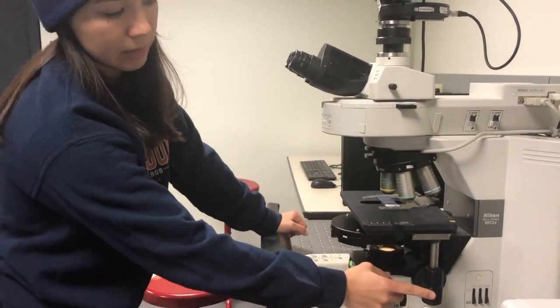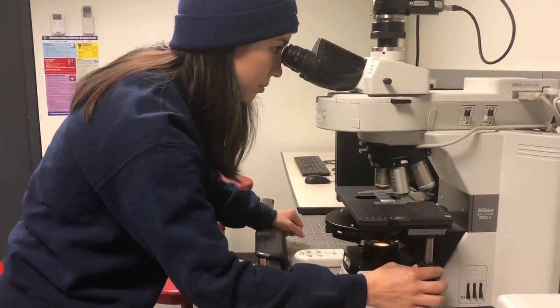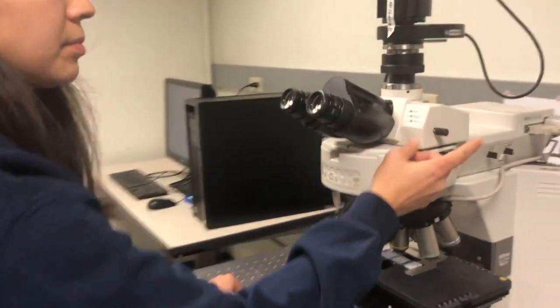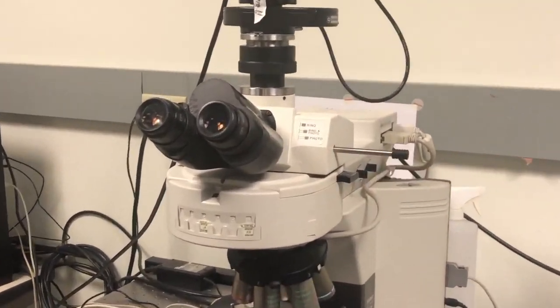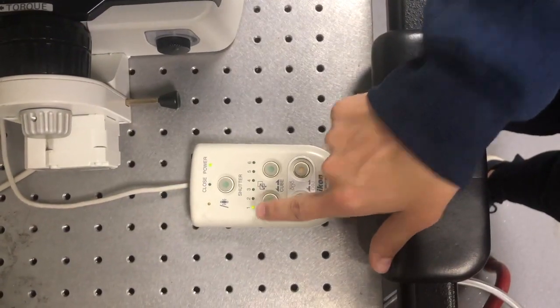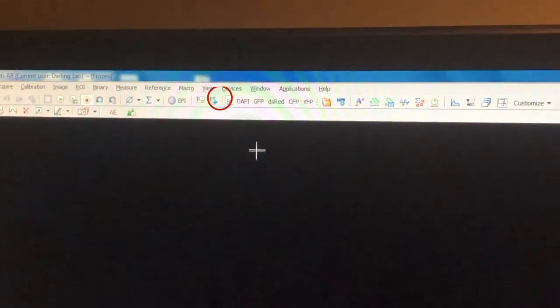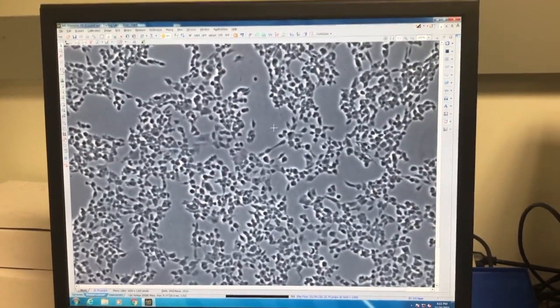Now to image some cells. Starting with Brightfield, focus on a region you wish to image. Look to the right of the oculars to find the bar and pull it all the way out to direct light to the camera. Select Filter Set 1 on the pad or choose BF from the menu bar of the program, and then press play to see a live Brightfield image of the slide on the stage.